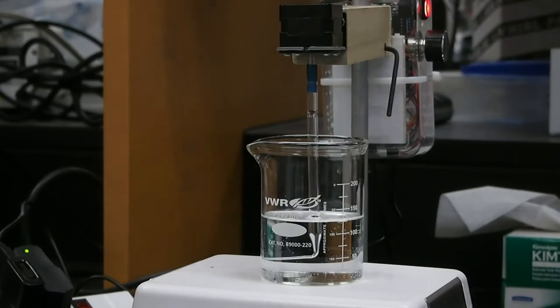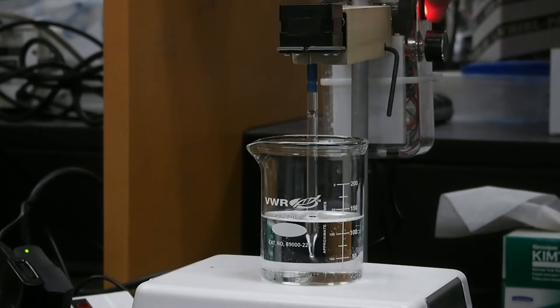Another plus is that I can place my sediment solutions under this stirrer and let it do its thing while I engage in more complex tasks.